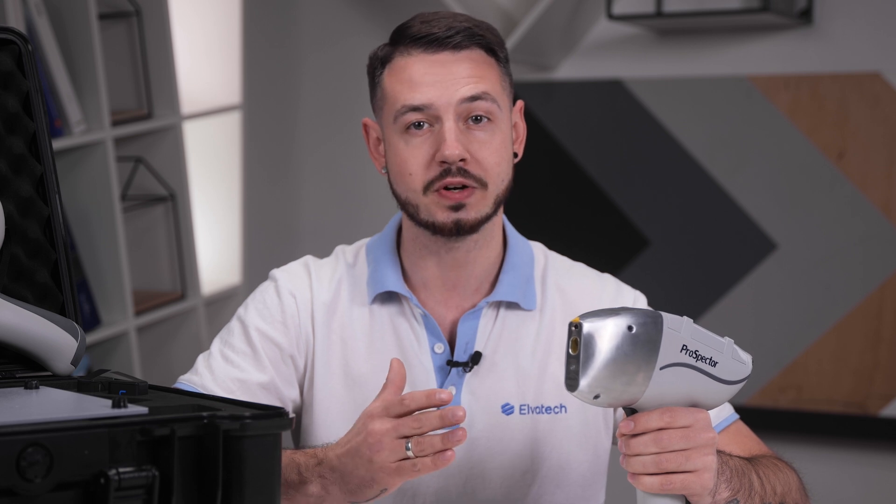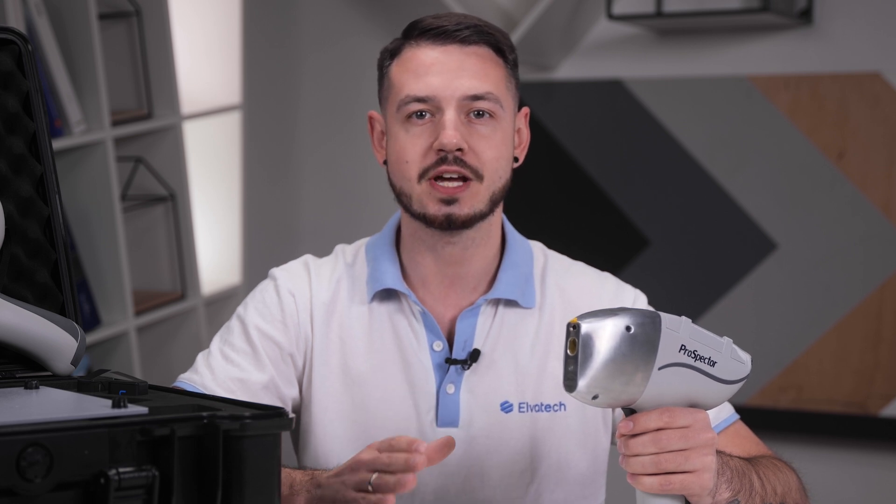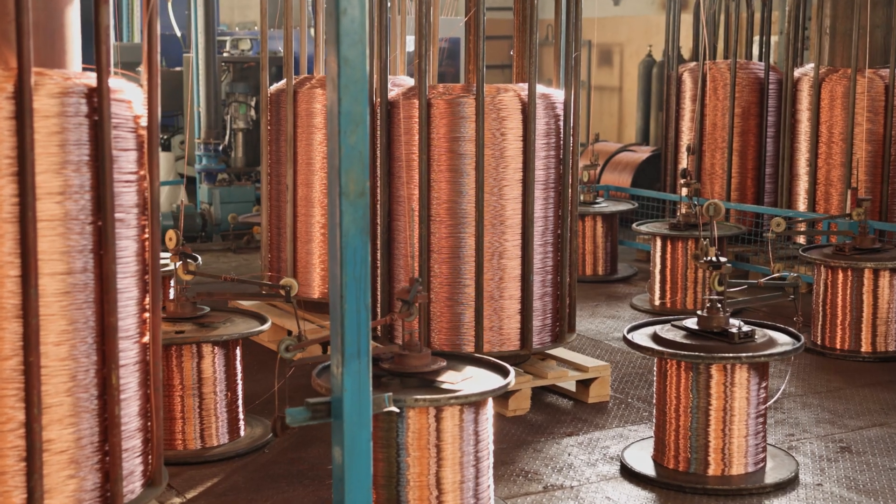The Prospector 2 is a proven analyzer which finds its application in various fields. It is perfectly suited for the analysis of auto-catalysts, metals and alloys, precious metals, and many other materials. It helps to identify elements and material composition with high accuracy and reliability. Let's now take a look at some of the Prospector 2 features and capabilities using alloy analysis as an example.